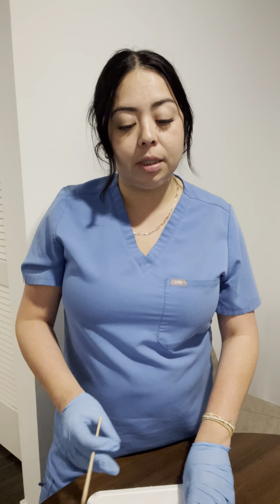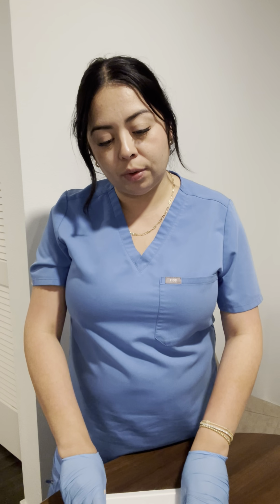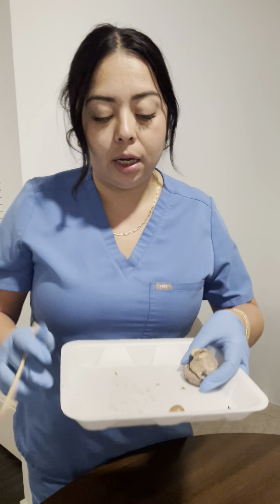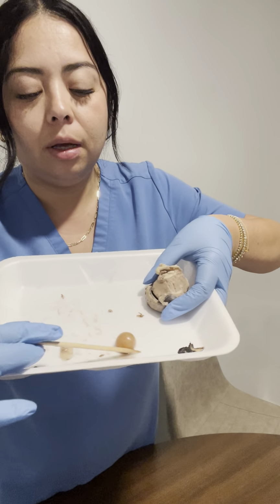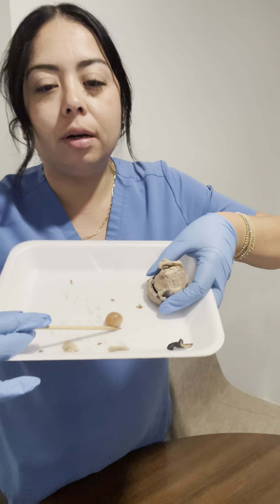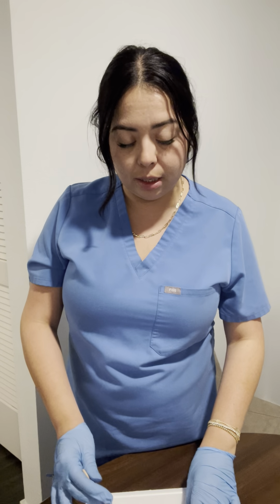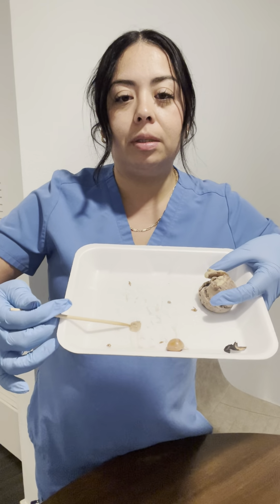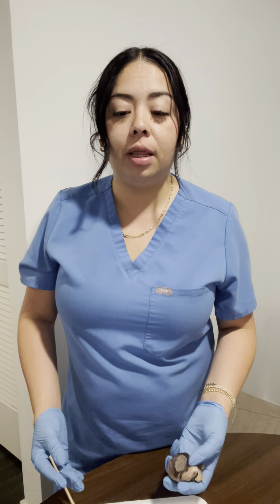Aqueous humor is a clear fluid inside the front of the eye that helps keep it inflated, as well as nourishes the tissues around it. It keeps the fluid pressure in the cornea, and you can see a very little bit down there. It came out when I dissected. And then we have vitreous humor, which is this jelly-like substance here, and that helps keep the round shape of our eye as well as prevent it from collapsing.